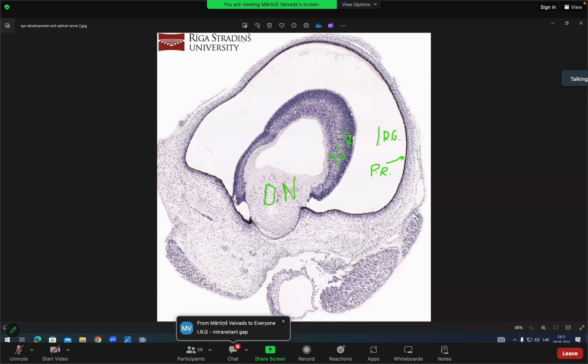So this is a very tricky slide to check because you don't see other eye structures. But if you think logically, it's not that bad. Of course, technically, we still have the choroid and the sclera, the connective tissue outside. Choroid and sclera, but it's not always visible that well. CH, that's choroid and sclera. But that's the general idea here. Okay, that's everything about eye development.